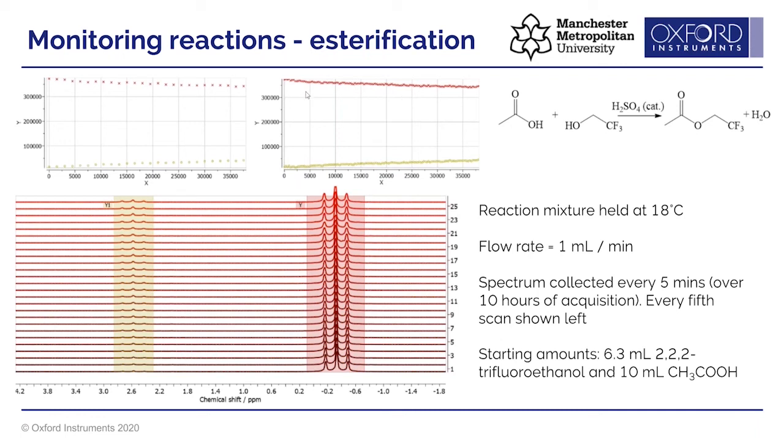And again, I can plot this data. It's a series of points, and we can see the reason why we probably want to do this over a period of 10 hours. That's because it's very, very slow. If I was only looking at 1 hour of acquisition, I'd be hard pressed to see if the reaction was proceeding or not. Whereas if I do it over this longer period of time, it's very clear that it is moving forwards.